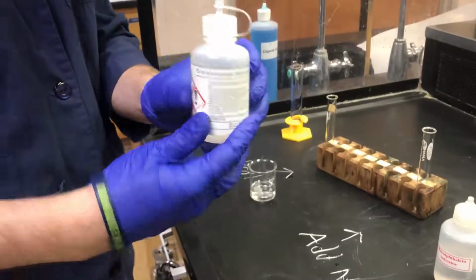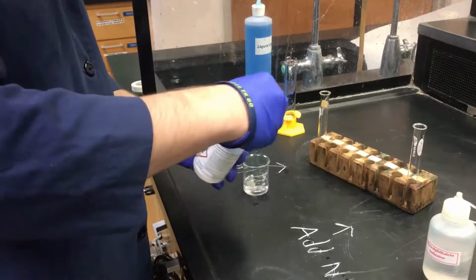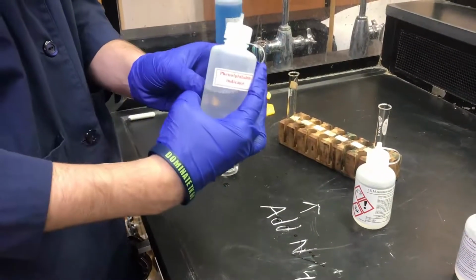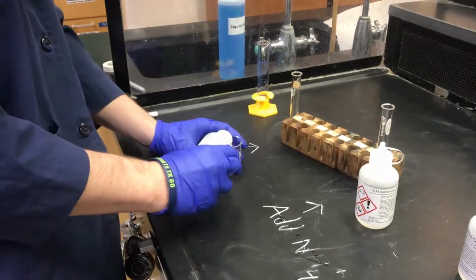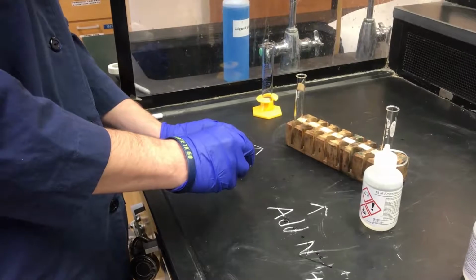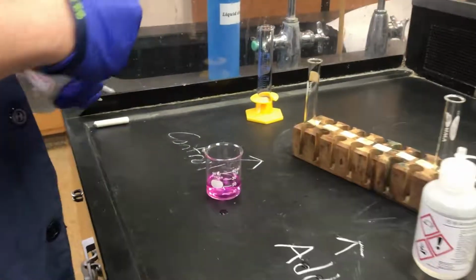And then about 2 drops of 15 molar ammonium hydroxide to that beaker. And finally, 2 drops of our phenolphthalein indicator. And this will make up our equilibrium mixture. And you'll see it turned pink to indicate basic conditions.